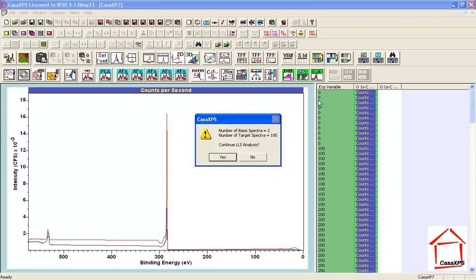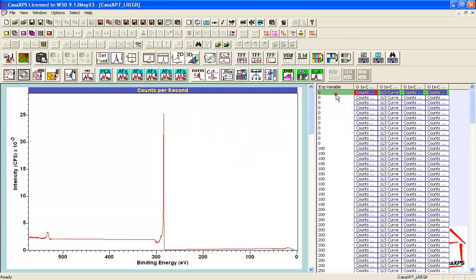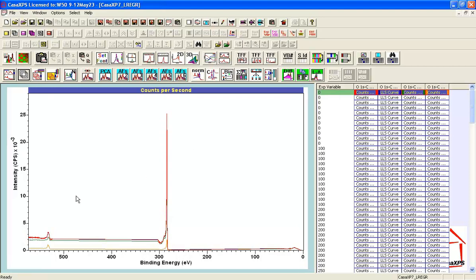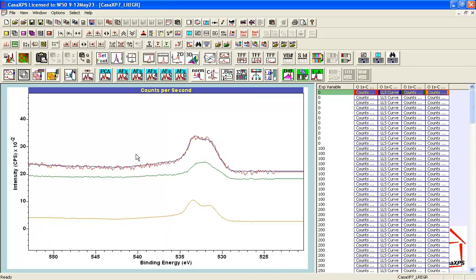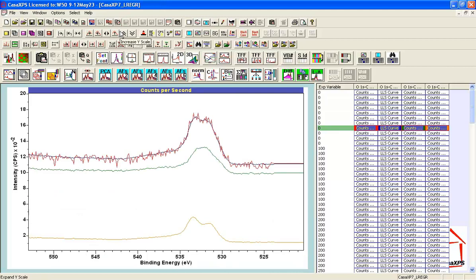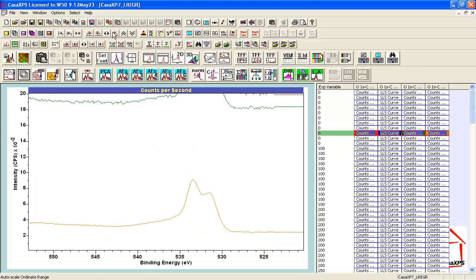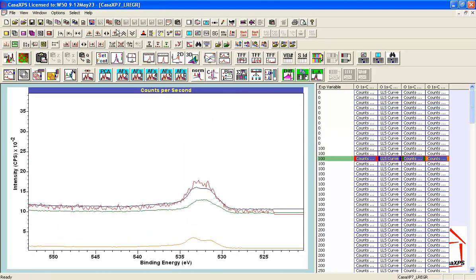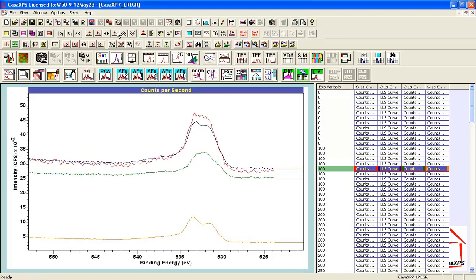Using the LA (linear analysis) toolbar button, the two components in the active tile serve as basis spectra for a calculation targeting 185 spectra — the oxygen, carbon, and valence band data. Pressing yes produces a new VAMAS file. Overlaying by row, the linear least squares fit of these two shapes to the oxygen is a pretty good fit, but that's not surprising since I used the first one in the calculation. Going through the data set, it does pretty well for the first set, then entering data measured at 100 degrees it's not quite as good.